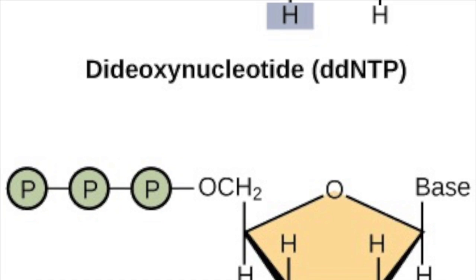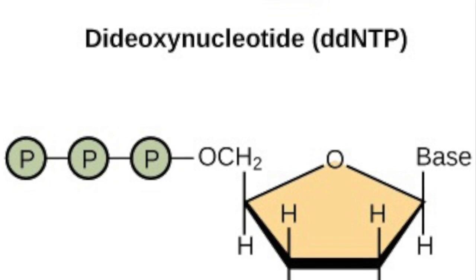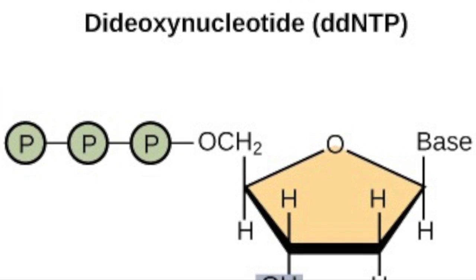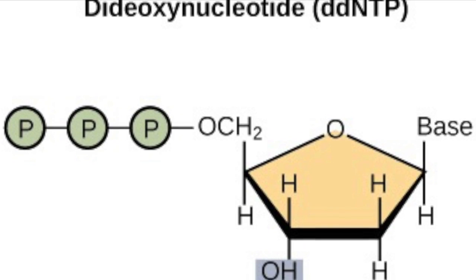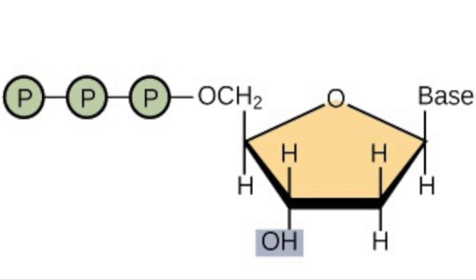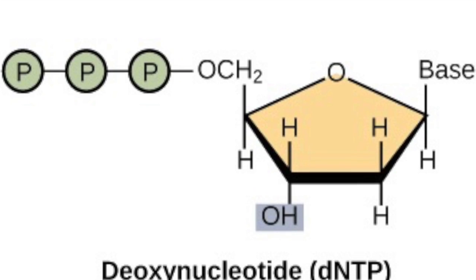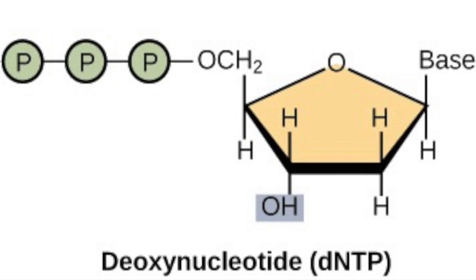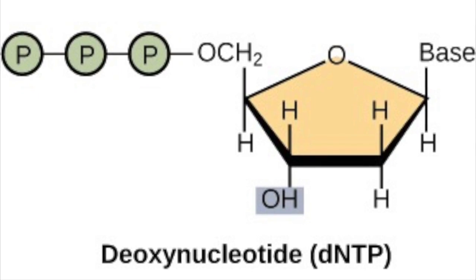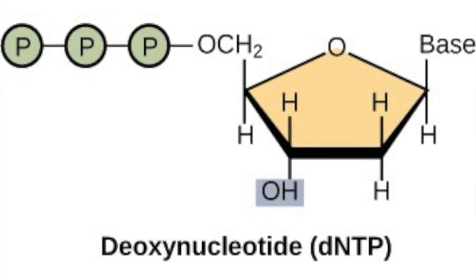The 4 DNA nucleotides, which are dATP, dTTP, dCTP, and dGTP. The template DNA to be sequenced. However, a Sanger sequencing reaction also contains a unique ingredient: dideoxy or chain terminating versions of all 4 nucleotides, each labeled with a different color of dye.